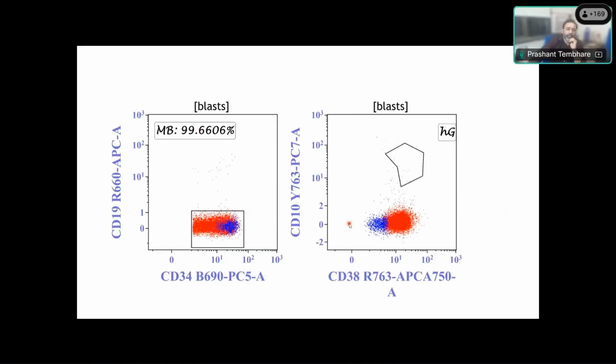Okay, now sometimes only the compartment study is helpful. For example, in normal bone marrow, we know there are myeloid blasts as well as their B cell precursors, that is hematogones. But absence of hematogones also indicates aberrant or clonal hematopoiesis in the sample, because normally, no matter the age of the person, there should always be some B cell precursors, and if the B cell precursors are typically less than 5%, then we consider that abnormal.